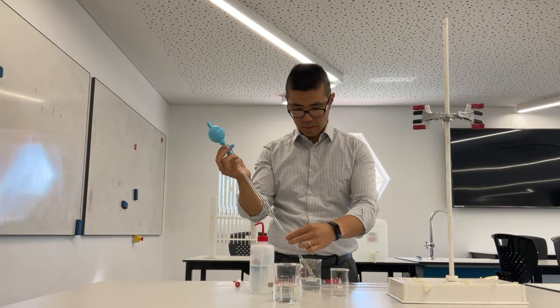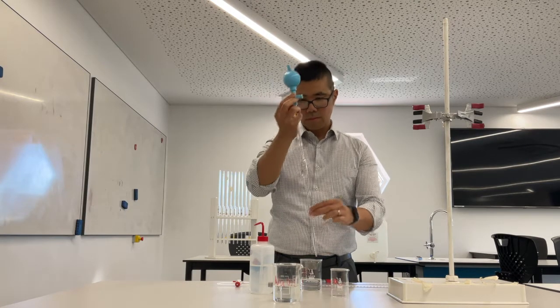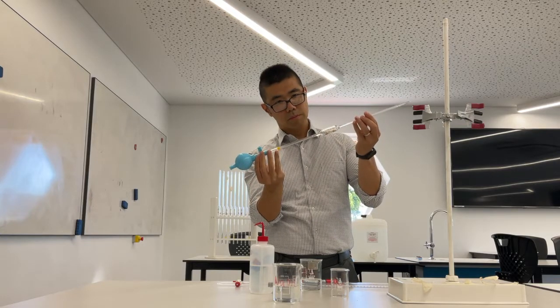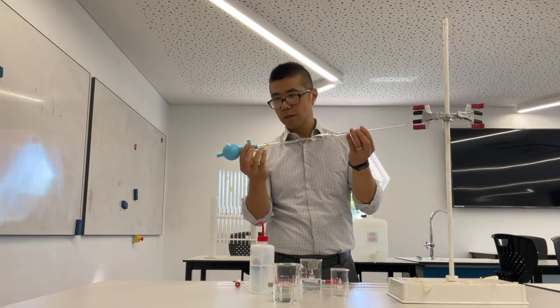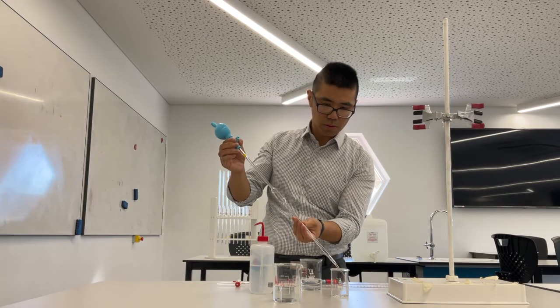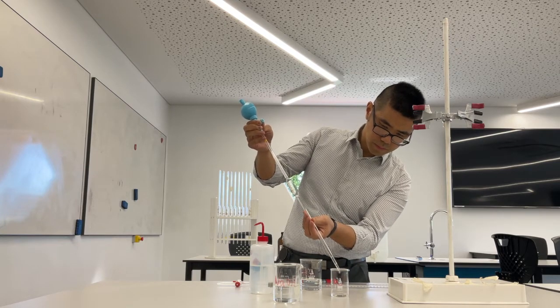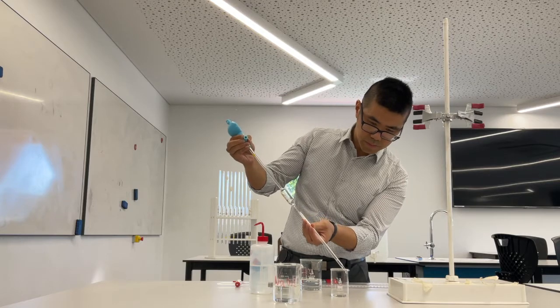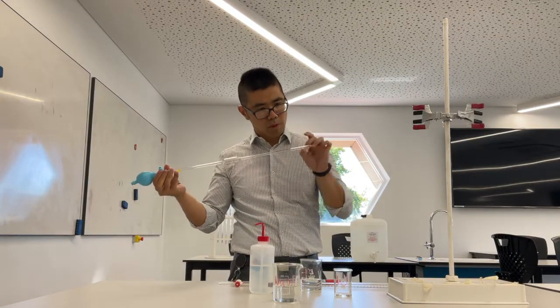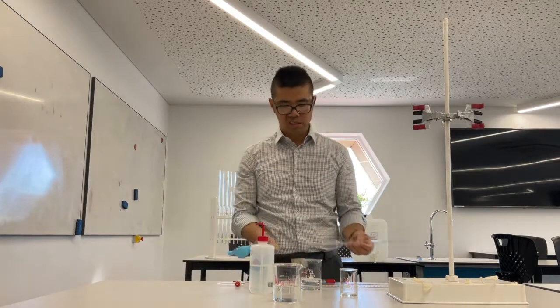You need to clean the pipette with the solution that you have. I'm half-filling up the pipette by pressing the S button on the pipette filler to suck the solution up. I only fill it up to a little part of the bulb, then turn it horizontally and rotate it to allow the solution to cover all the surfaces. Then I press the S button until the solution goes past the line, rinsing all the way past the line. Then I press the E for empty button on the pipette filler so all the fluid flows out. To get the last part of the solution out, you touch the edge of the glass against the glassware you're emptying into — in this case, the beaker. So that pipette is now clean, rinsed with the solution it's going to hold.